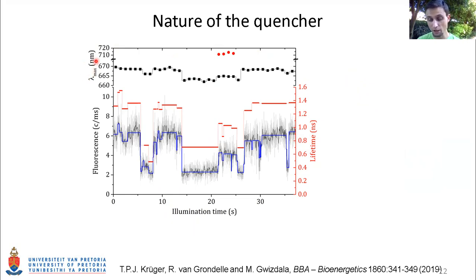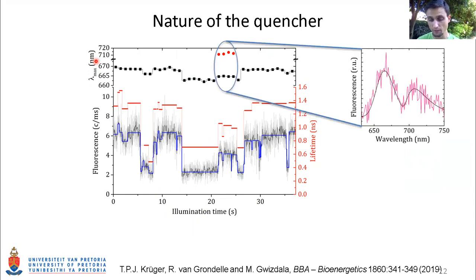The complexes occasionally displayed enhanced red emission, and in 80% of the cases, this red emission was preceded by a long-living quench state, which means that the quench state must be associated with the red emission state. This correlation required further investigation.